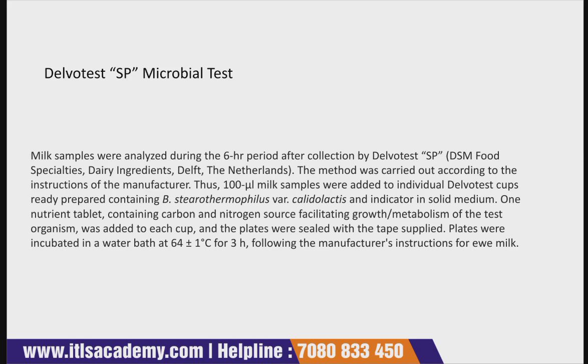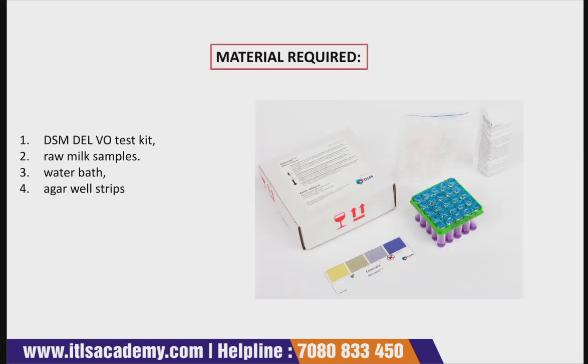After you add that, the plate is sealed, which means you seal the plate with the tape that has been supplied. Then the plates are incubated in the water bath at 64 degrees centigrade plus minus, for 3 hours, and as per the manufacturer's instructions, they record the values or observe the sample.